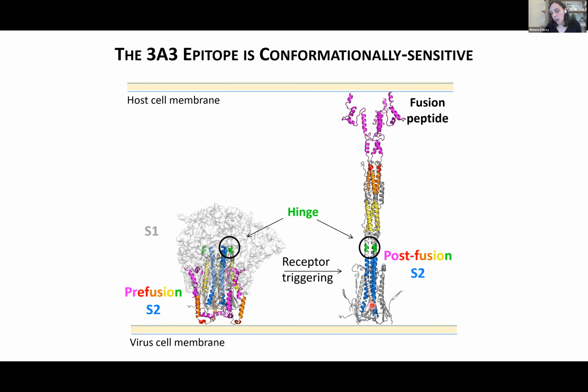But I can tell you there is a paper out there that did do this. And I believe the conclusion was that it's really quite advantageous if you have multiple charge states. So it might not drastically increase your coverage, but it will allow you to detect multiple charge states of the same peptide. We do use it routinely. Prior to starting my own lab, I had never used it, and I still had sufficient peptide coverage of my proteins of interest.